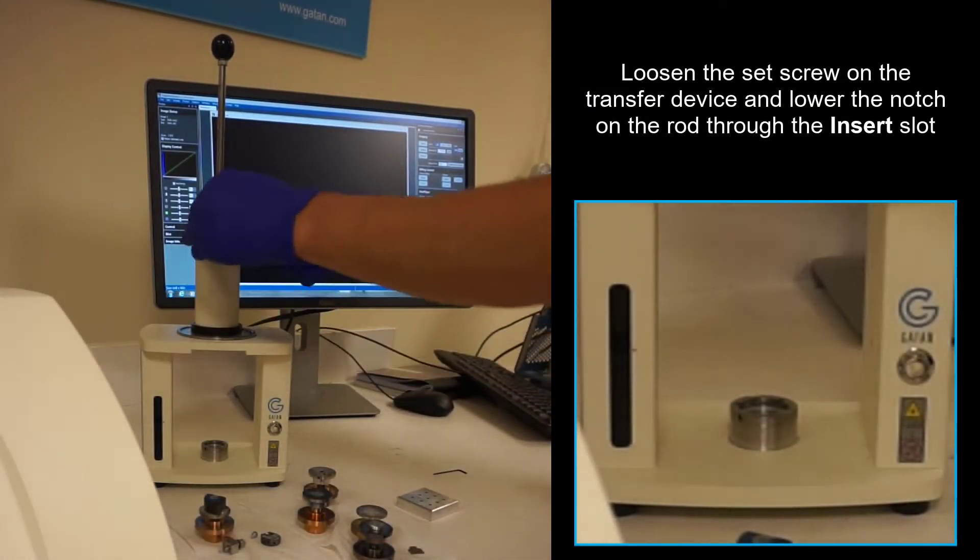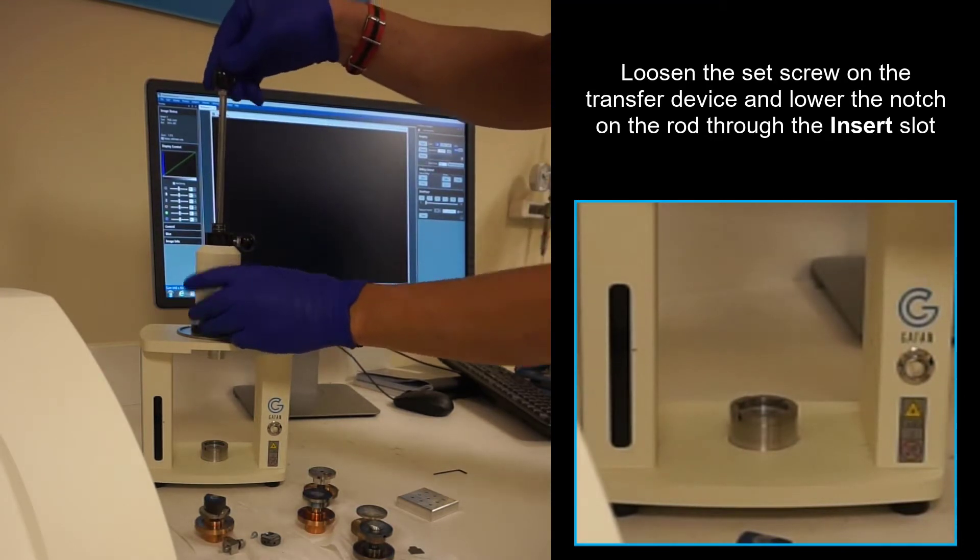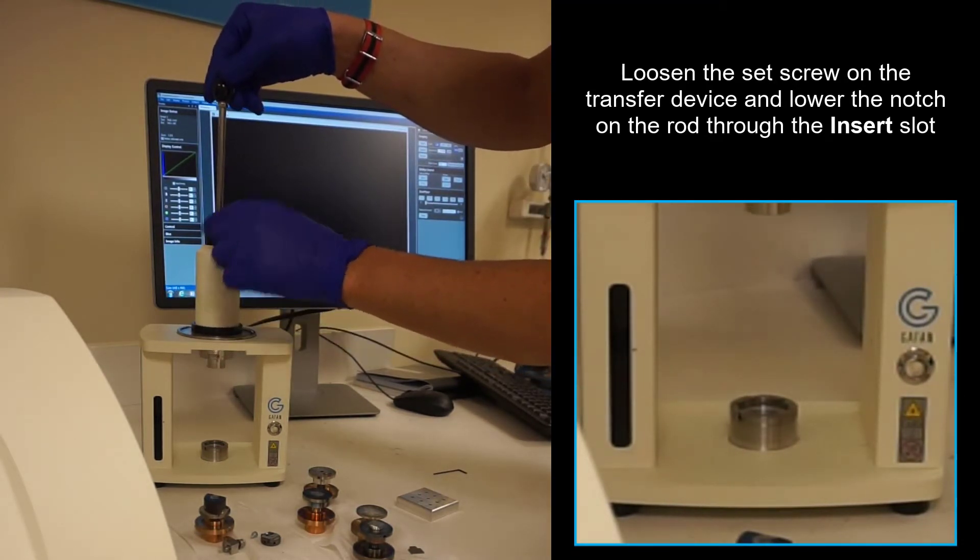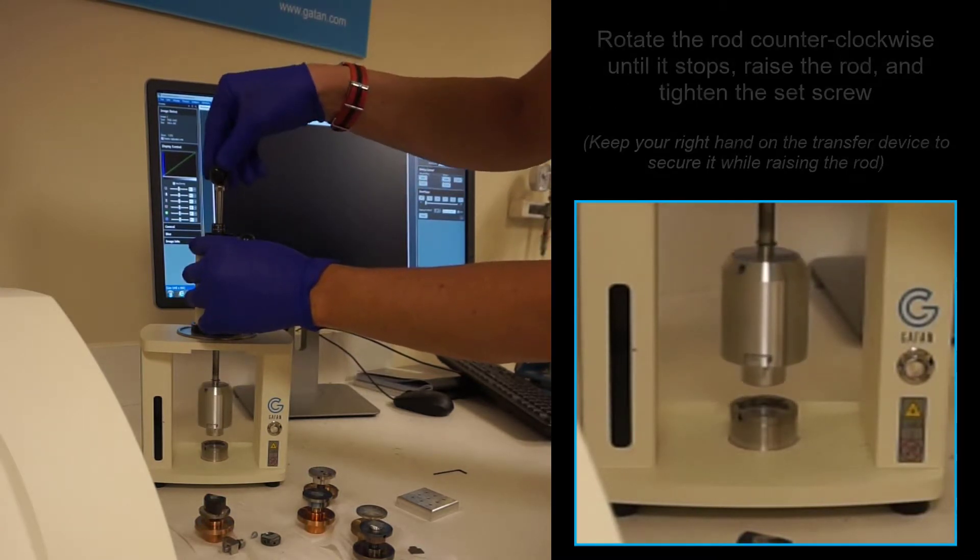When removing the sample, you just do the reverse action. There's a little notch up here, and it will slide down in one of these two slots depending on whether you're inserting or removing a sample, which is marked on the front face.